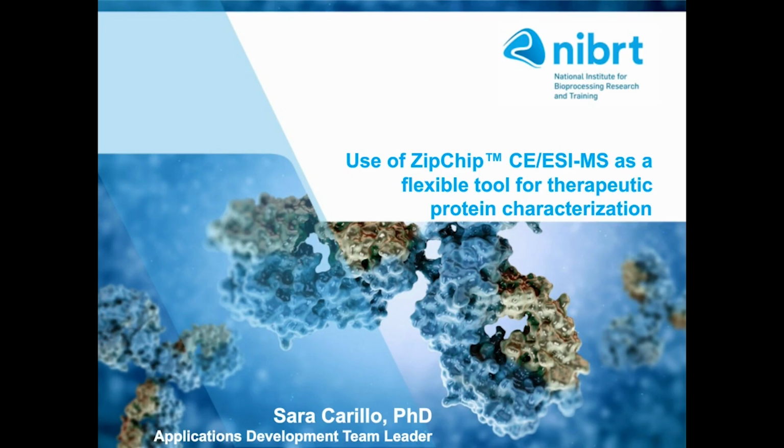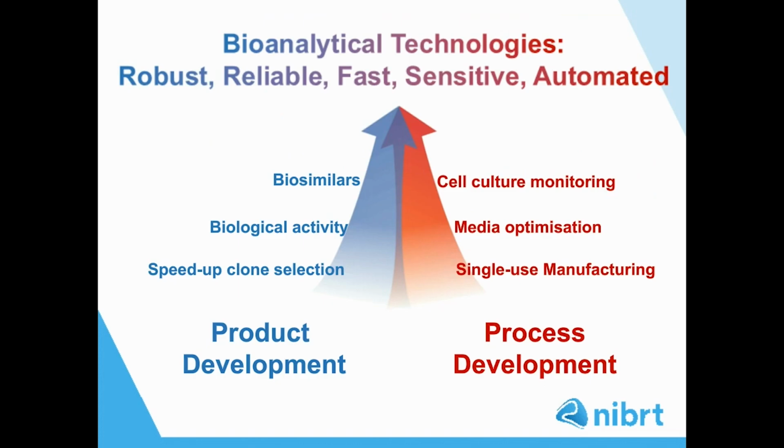So biopharmaceuticals production is in continuous growth with an increasing number of products entering the market, like biosimilars, for example. As well, biomanufacturing techniques are continuously evolving, also bringing big changes such as the introduction of single-use devices, for example. This is forcing bioanalytical technologies to a constant comparability exercise to prove no changes are introduced in the final product, and to always obtain more structural details that allow confirmation of the drug's identity.